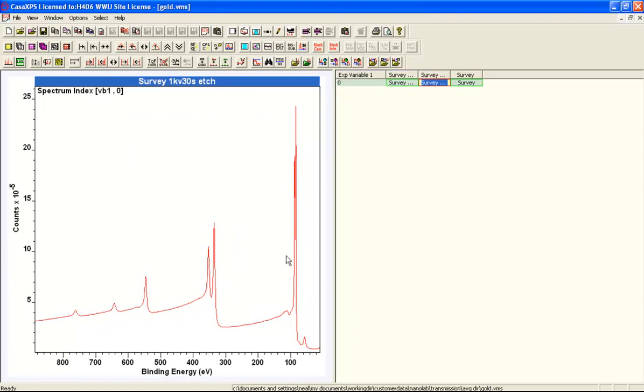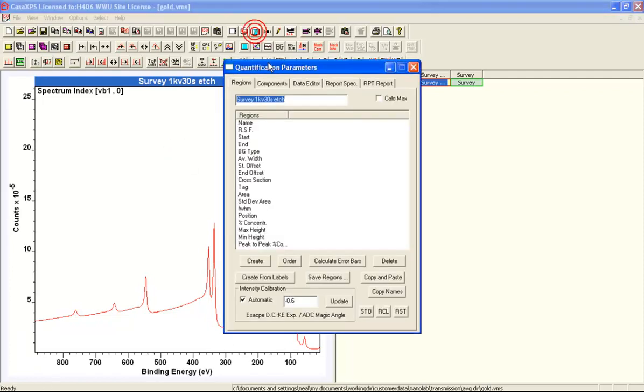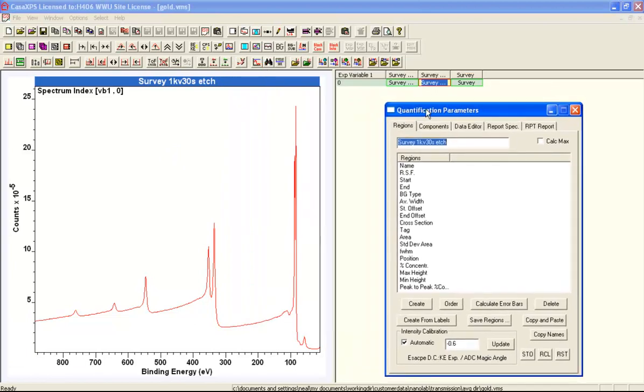We'll use relative sensitivity factors and verify that we get something that makes reasonable sense in that we've got one, two, three, four, five different peaks. So we should get about 20% from each one of these peaks if we apply relative sensitivity factors and other corrections appropriate for quantifying survey data.